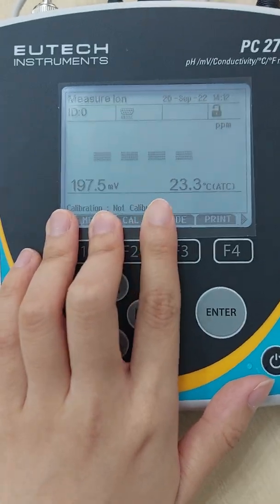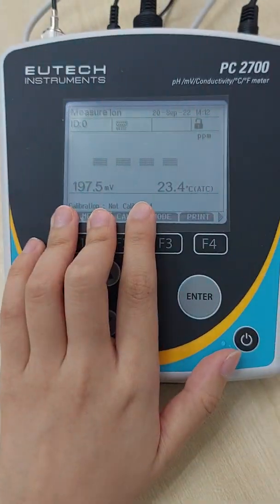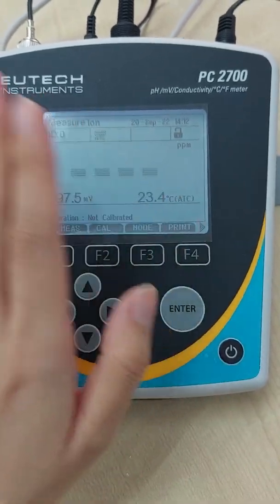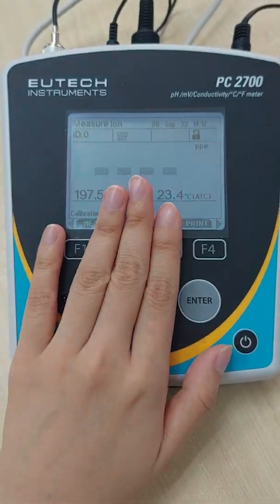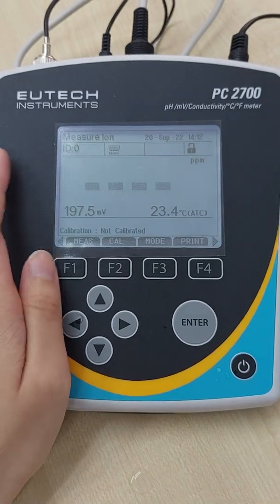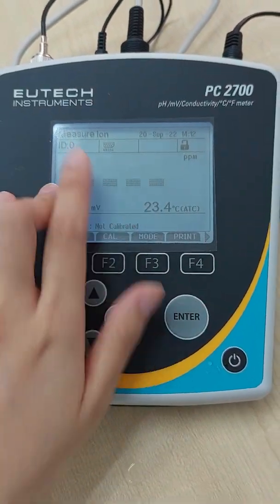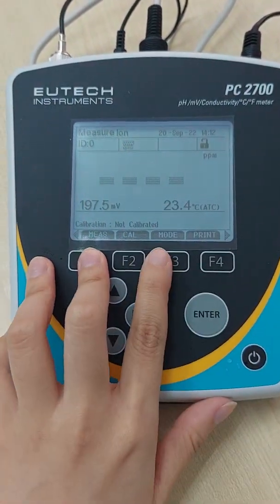So ion is depending on what kind of ion you want to measure. Let's say if you want to measure calcium ion, then you will need to get a separate calcium probe. Let's say you want to measure sodium ion, then you need to get a separate sodium probe.